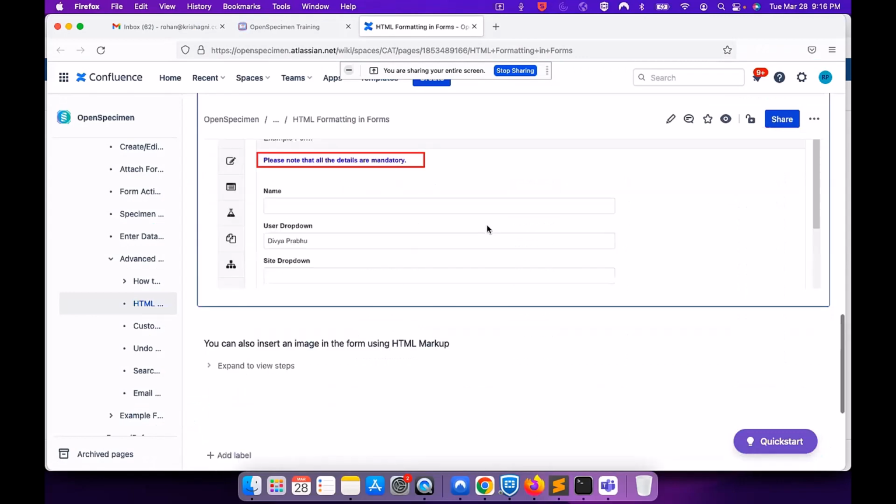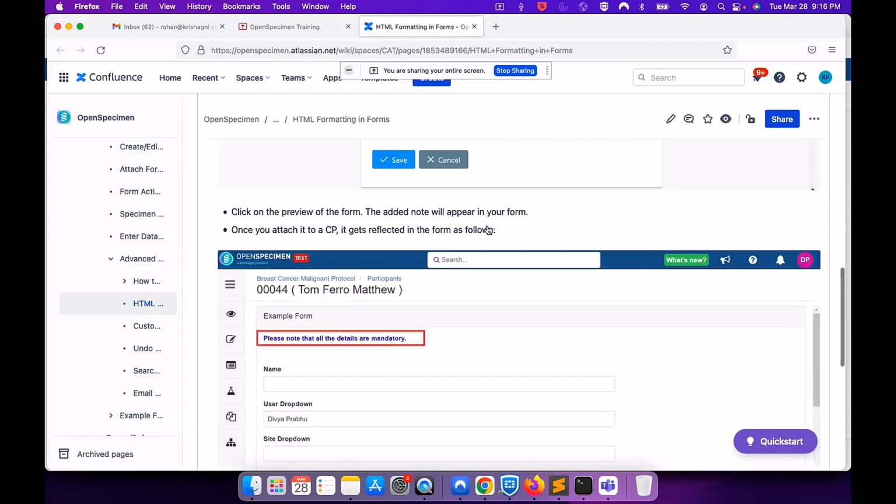But this entire functionality is meant for highlights, like changing the label, text color, or adding some border. If you make more changes to the actual layout of the form, it is most likely going to break somewhere when screen resolution changes. So you have to make it very standardized if you are going that route.